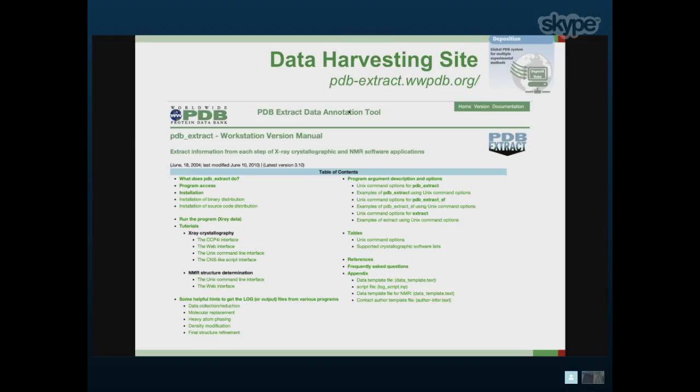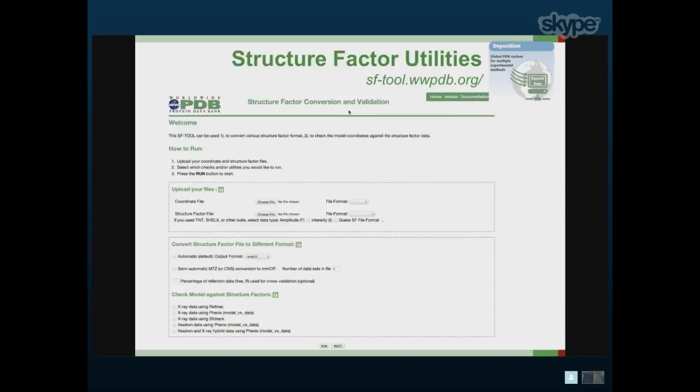We provide websites and software tools, some of which are already embedded in large packages, to do log file and output file harvesting. This is a very pragmatic approach, which we've had to take because of the lack of compliance with metadata. But I don't think this is a particularly good future direction to adopt. It's a very high maintenance problem. So we do similar things with process data. Most of this data comes to us in the form of binary packaged files, such as MTZ files. And that's all converted. Data is extracted from those formats and put into CIF packaging for deposition.